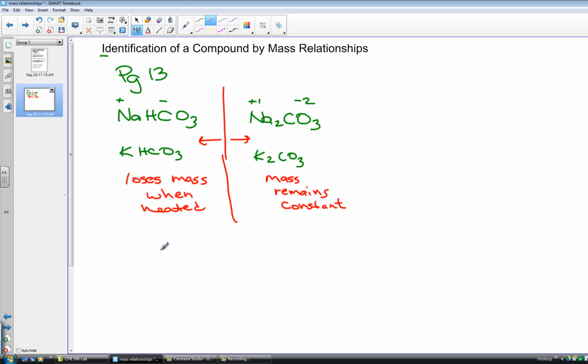You're going to heat this substance over your Bunsen burner, and the heating pot is called a crucible, and you'll use a clay triangle sitting on a ring stand, and then you'll place your pot there. So just kind of a visual, this would be your ring stand, this is your burner, a clay triangle sitting over your ring here, and a clay triangle really is just literally that, 1, 2, 3, best I can place a triangle there, and then your cooking pot will go inside the clay triangle with a lid on it, and this of course is where your sample is in the bottom of this cooking pot here, known as a crucible. These are in your stock drawers, alrighty?